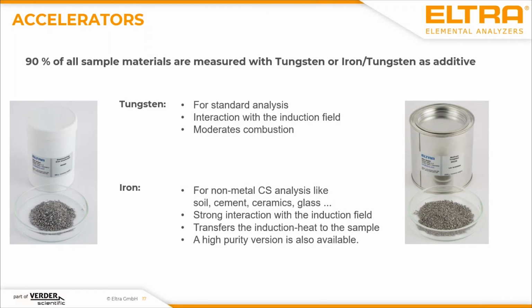So I will talk a bit about this because this is now a bit more, let's say, complex, but at the end it's easy, because it's like cooking. You have to learn when to use which accelerator, but once you know, you can use this as an SOP, standard operation procedure, for your metal, and then you don't have to change it again.